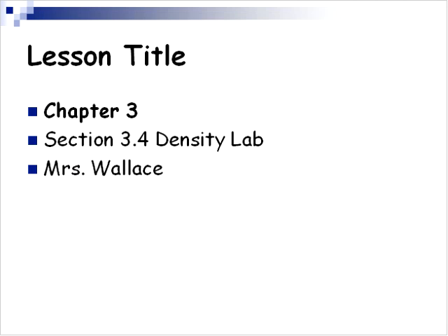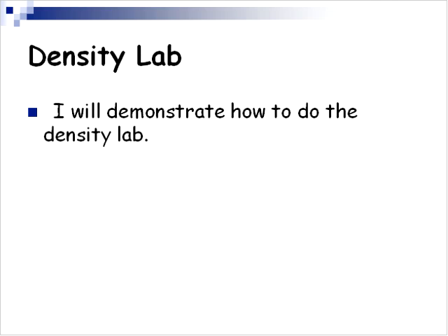What I'm doing is recording instructions on how to do a density lab. This lab is not one of the ones that are on the CD. This is just online, and I'll give you the link. I wanted to explain it, but we don't have enough class time to take a whole class day to explain this. So I'm going to demonstrate how to do this density lab. It's fun to do.